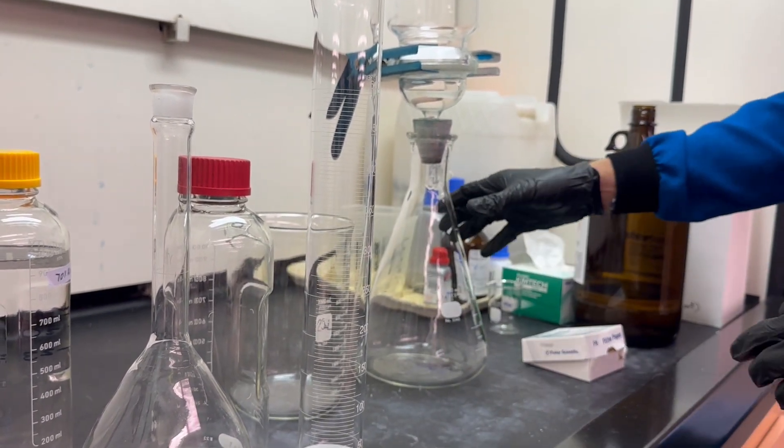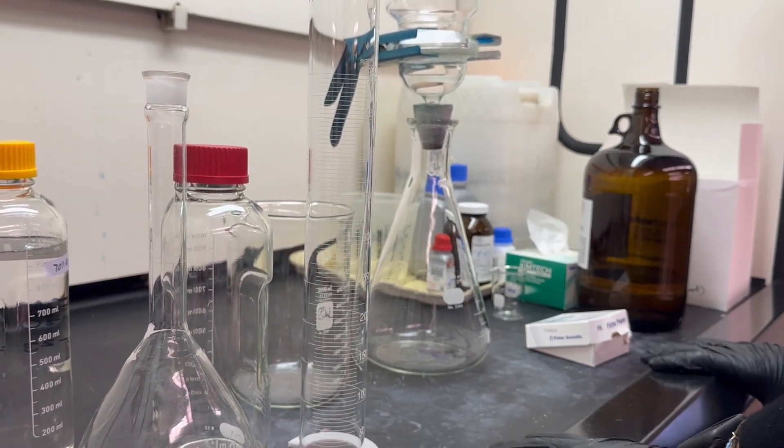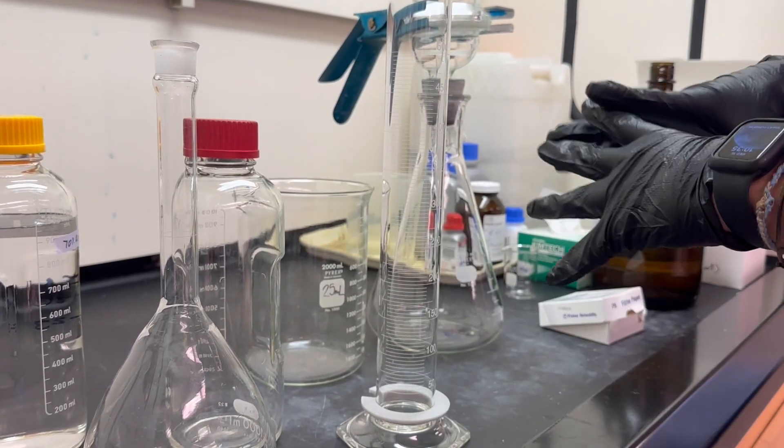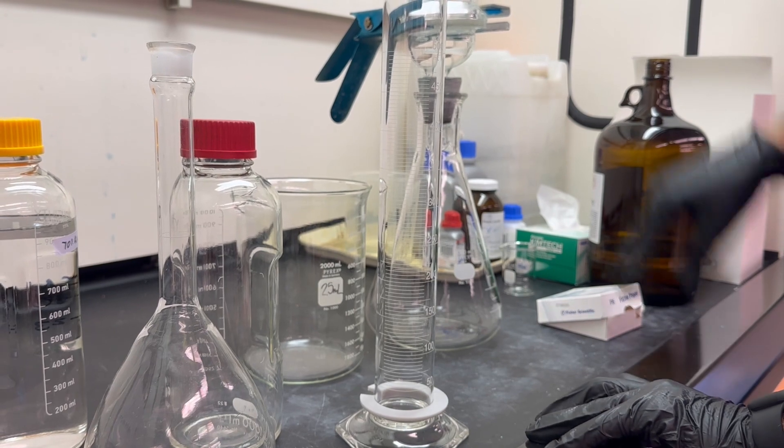To make a 70% ACN, 30% water solution, all we need is 700 mLs of acetonitrile and 300 mLs of water, add those together, mix for 20 minutes, vacuum filter.